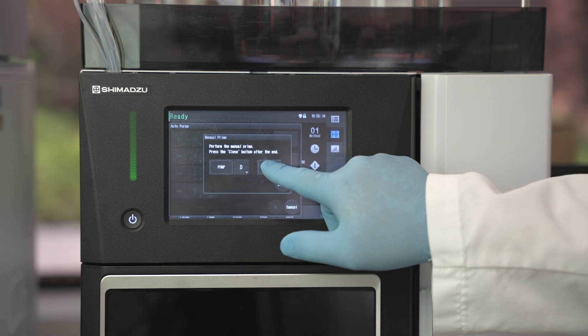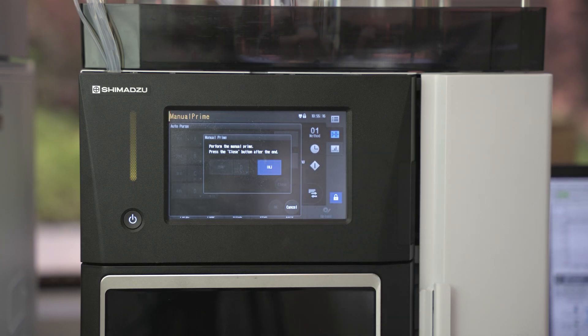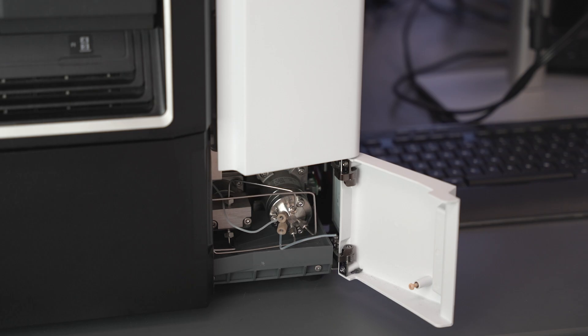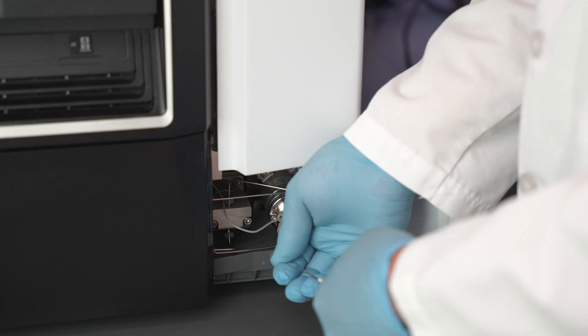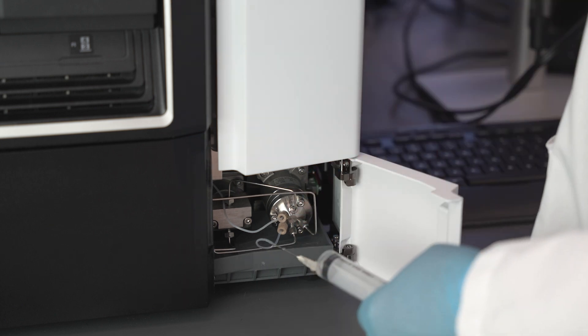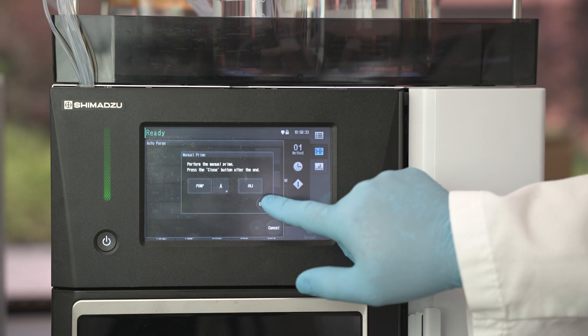After the pump prime, press the injection button on the same page. Pull vacuum on the syringe and collect 10 to 15 milliliters of mobile phase. Close the manual prime page.